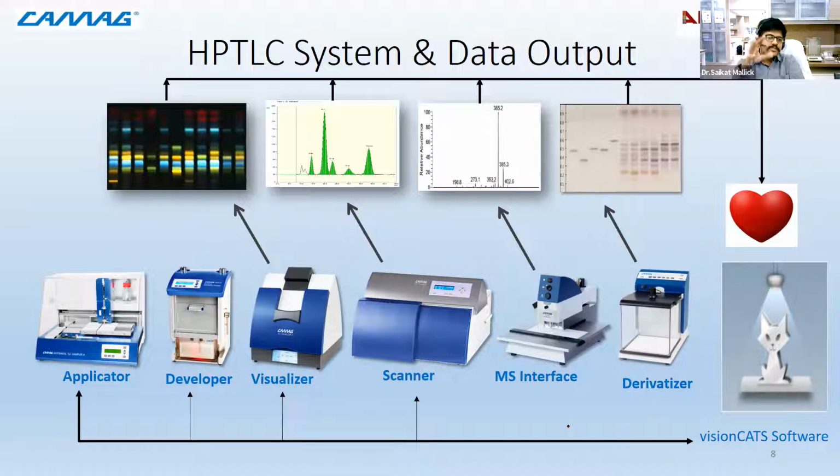with the help of the same device. So it is doing many jobs at a time, and that is the development part. After that comes the visualizer part, which documents the image.